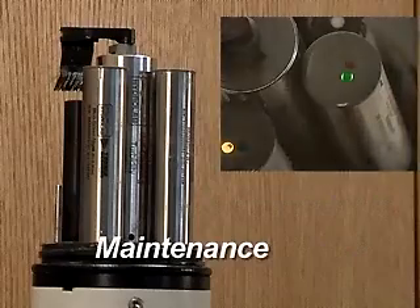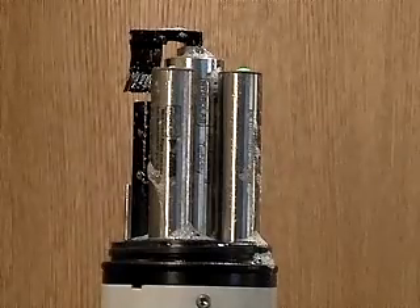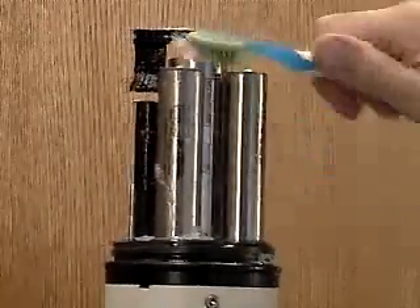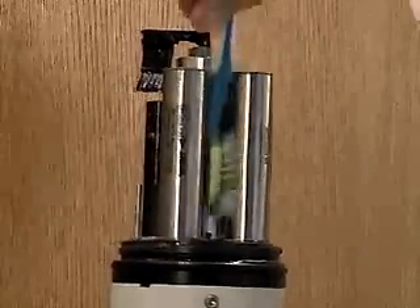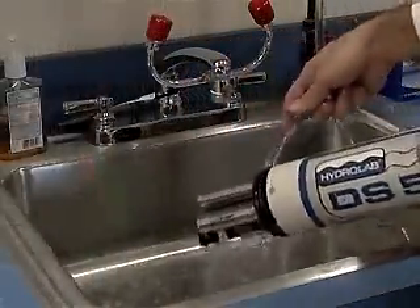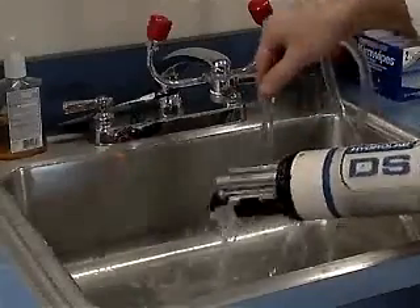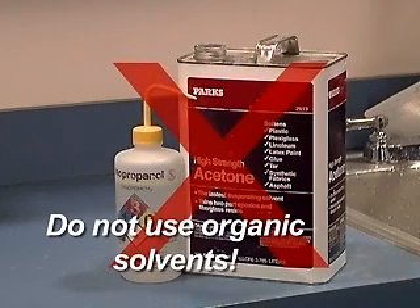Maintenance. The only maintenance required for the fluorometers is to keep them clean. As optical sensors, it is very important to give them a clear field of view into the water sample. Before and after each deployment, use a soft brush and mild soap to remove dirt and debris from all of the sensors. Rinse with clean, fresh water. Do not use organic solvents such as methanol or acetone to clean the sensor, as these chemicals will damage the plastic components.